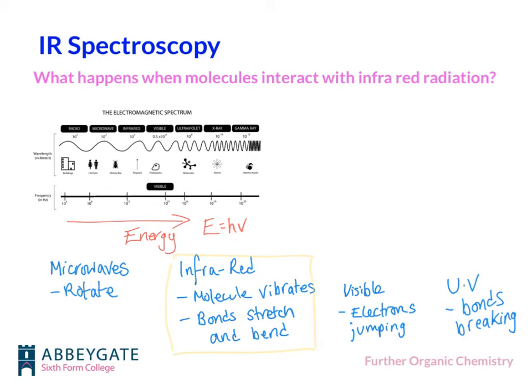So we're going to move on now and have a look at the bit that you're likely to get examined on, which is actually looking at the infrared spectra and being able to interpret them.